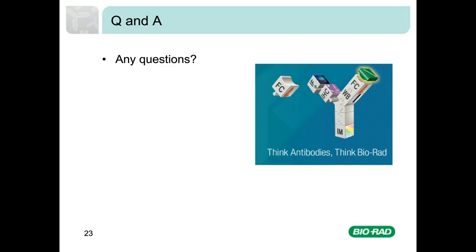Firstly, the PMT voltages have to remain at the same values used in the original experiment. Also, you need to use identical fluorophores, and the brightness levels mustn't exceed those that were originally used to set the compensation. If you're using tandem dyes in your panel, then these can actually optically uncouple over time, and this will increase spillover. I would recommend you always perform a compensation step with panels that include these fluorophores.